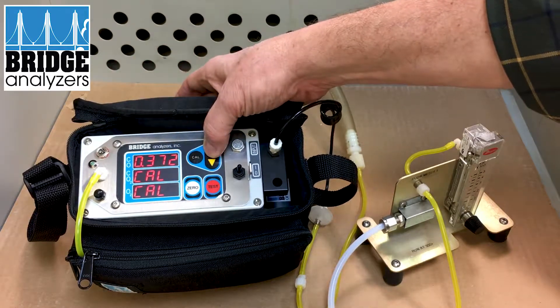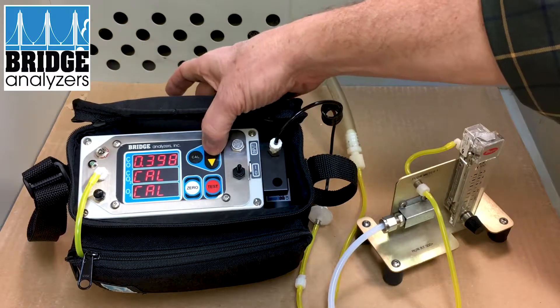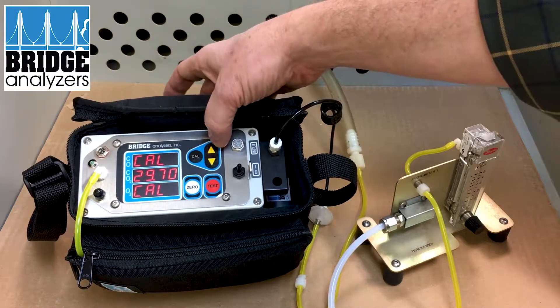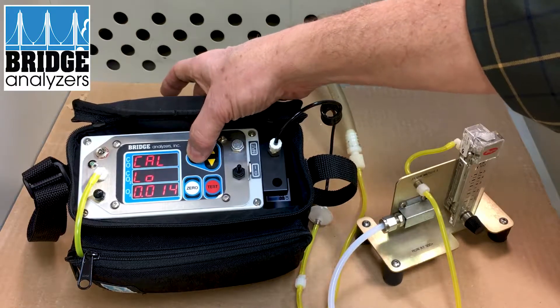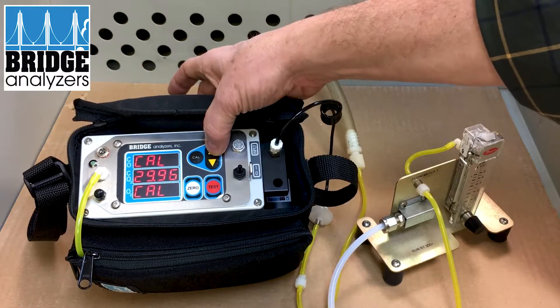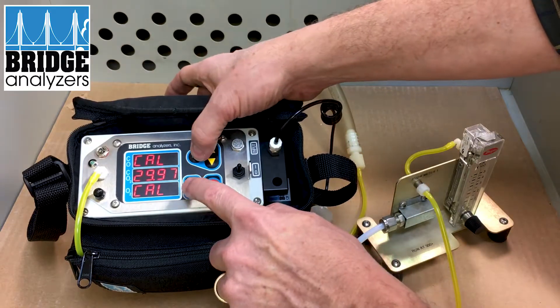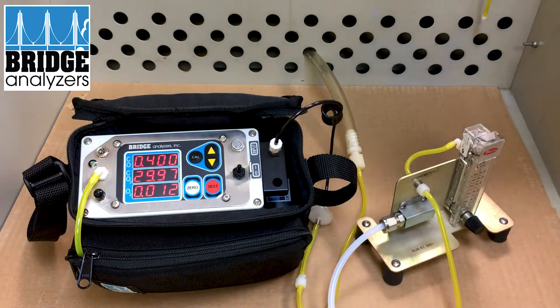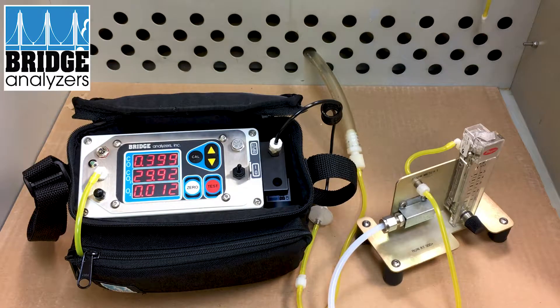Now I'll go back to carbon monoxide. For CO, that's 0.4, so I'll go ahead and increase it here. I'll double-check my CO2 — that looks good. Once everything is set, I'm reading properly: I have 0.4 CO, very close to 30% CO2, and essentially zero on the oxygen. So now I've calibrated.